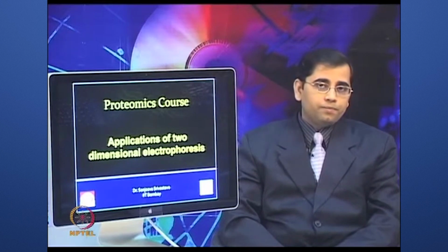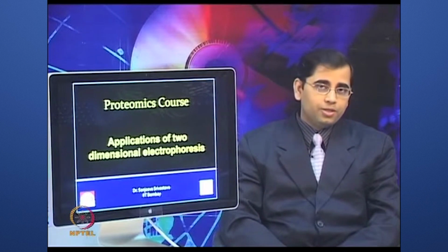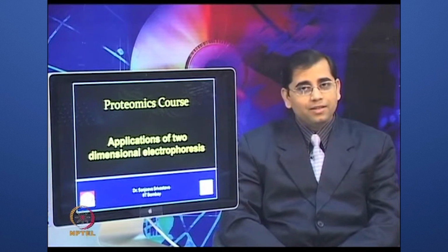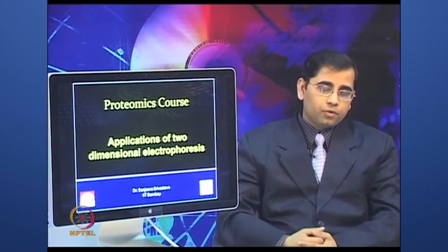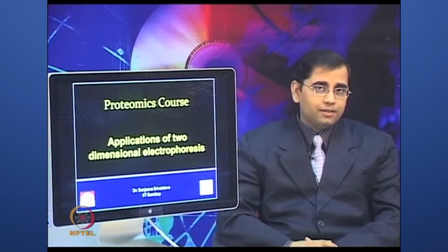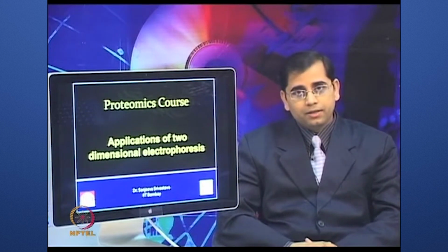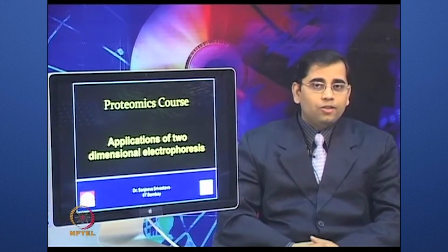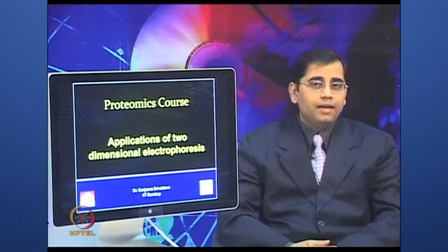Now, today we will talk about how these techniques can be applied for understanding some biological questions. This is time for us to assimilate all the knowledge which we have acquired during the last several lectures. For example, what one needs to take care of during protein extraction, then isoelectric focusing, second dimension protein separation, followed by gel analysis.